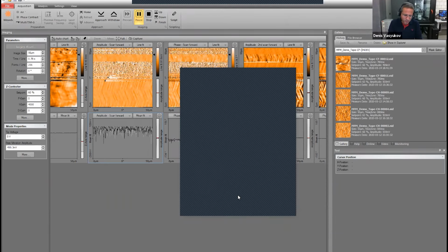What we do is put them on a screwdriver like this. Then when you put your cantilever on the cantilever holder, you approach your magnet, not touching, of course, because if you touch, you destroy your tip. So you approach the magnet to your tip, say a few millimeters away. You can see it by eye. If you're not certain, you can build some sort of contraption, but even 5 millimeters would be enough, because the magnet is rather large, so a few millimeters away the field is still homogeneous. This is how we magnetize our tips.